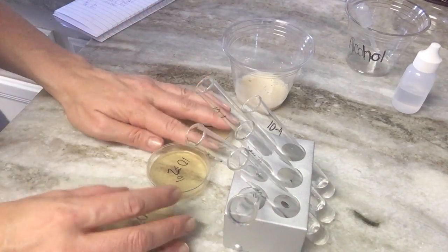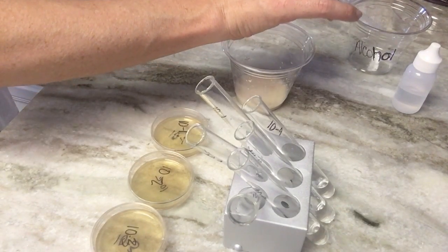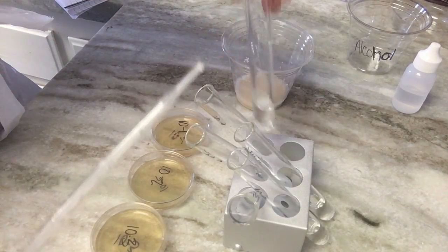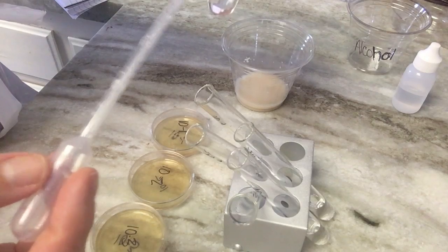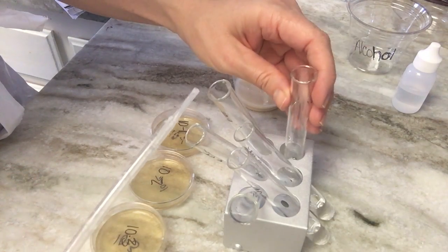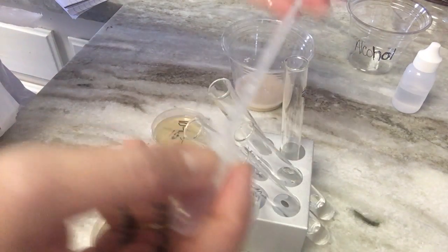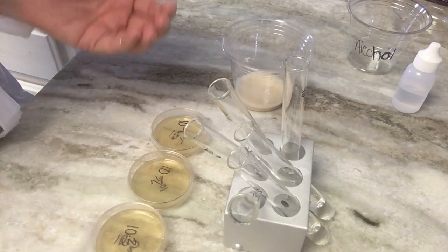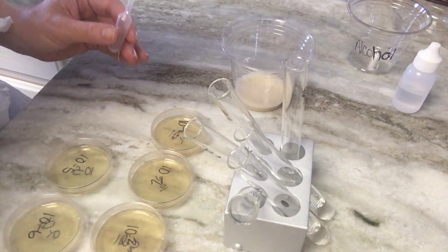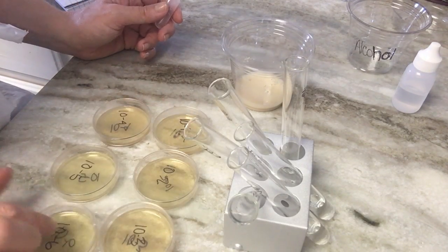And so what we did so far is, each one of these tubes, as the instruction shows, has 2.25 milliliters of distilled water in each one. And then, there's 10-1, 10-2, 10-3, and we go up to 6. Same with our agar plates, right? So we have 6 of these, all labeled, and these have dried for over 24 hours.